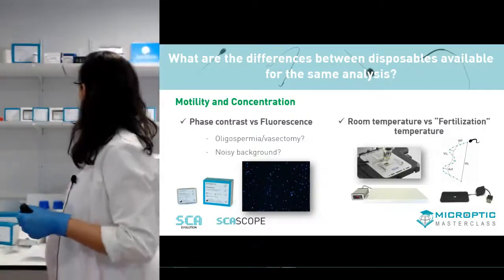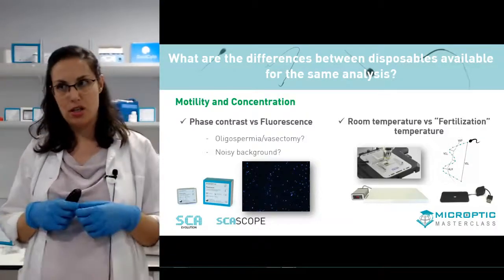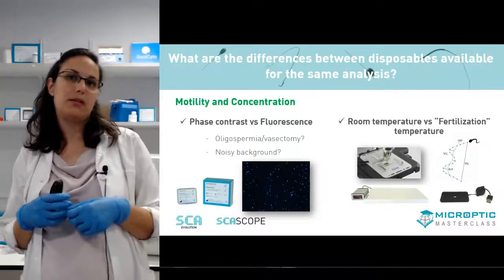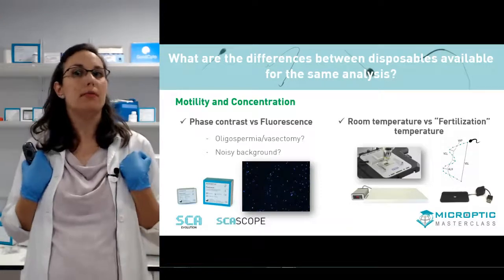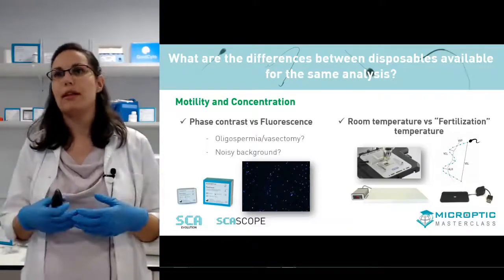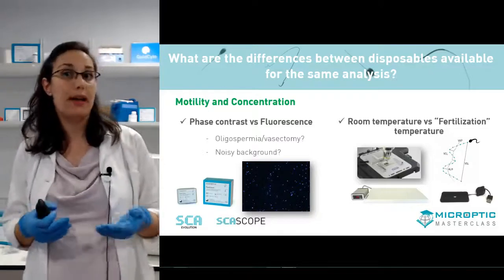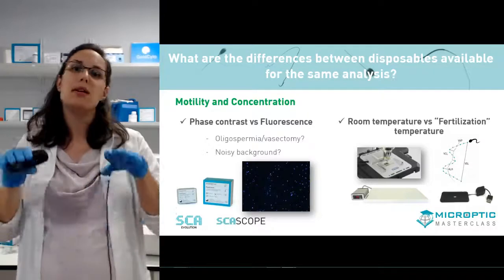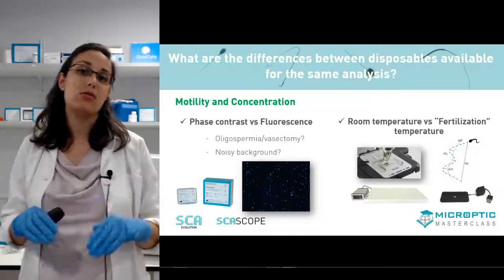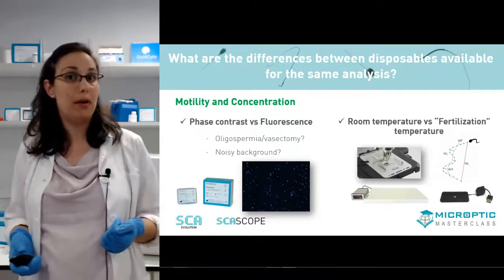Conversely, if you are working with a fish species or marine invertebrates, in which the temperature should be below body temperature, at 10 or 15 degrees, you need a cooling stage. Again, you can put it on the microscope stage in order to preserve the best conditions for assessing sperm motility under natural environments.